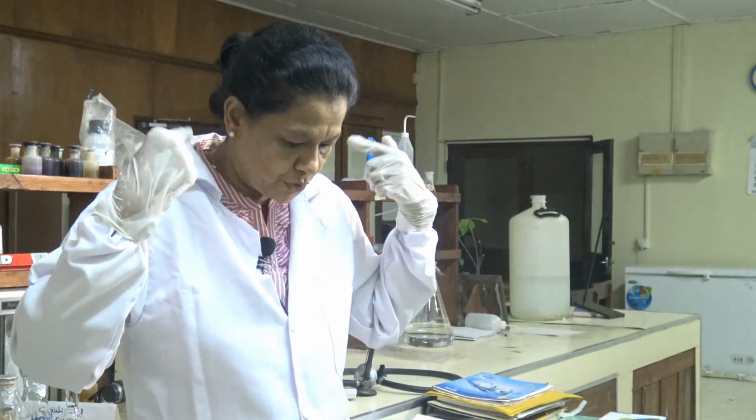And when you enter the laboratory, you have to wear the overcoat. Always button your overcoat and make sure the cuffs are tied onto your glove.